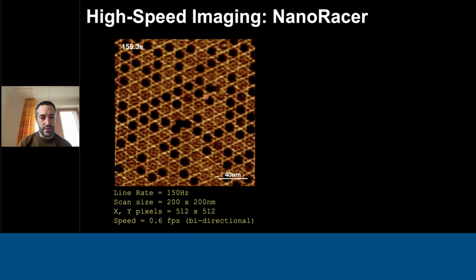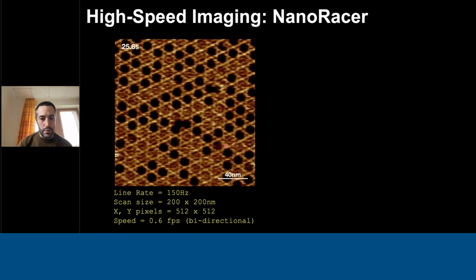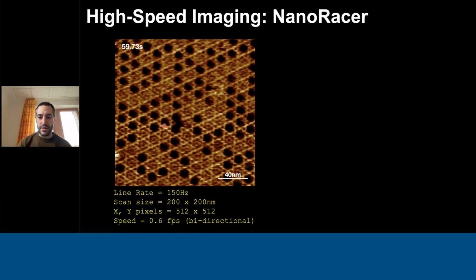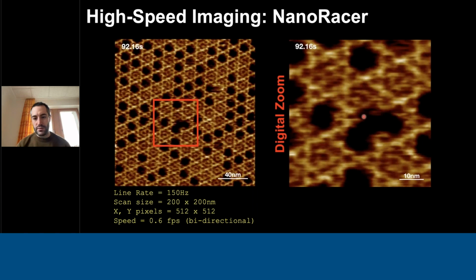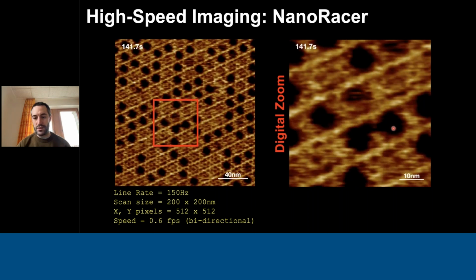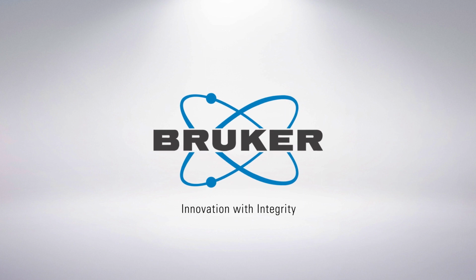So occasionally in some of these you will see a trimer pop in and disappear. If you focus on this kind of central one, we've got 3 holes, and we can track how one trimer, or possibly 2 at sometimes, is moving around between different positions here.